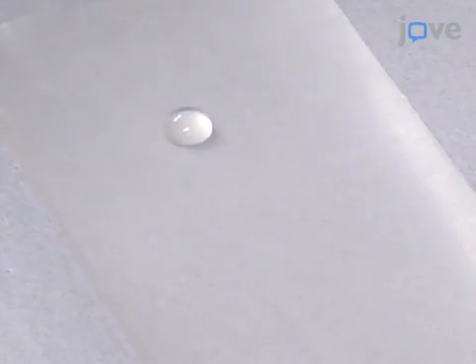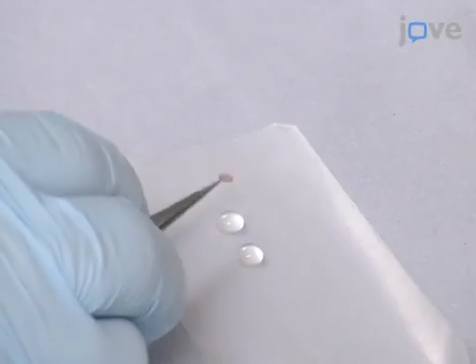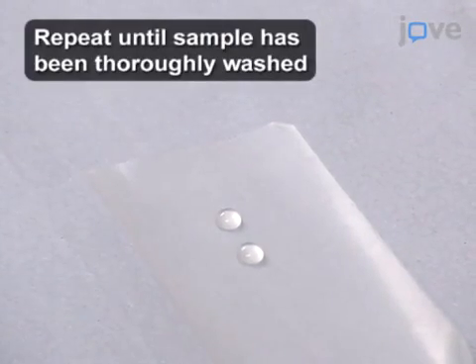Next, place 50 microliter drops of ultra-pure water or an appropriate volatile buffer solution on a sheet of laboratory foam. Gently touch the carbon surface of the grid to the drop and lift off a small droplet onto the surface of the grid.